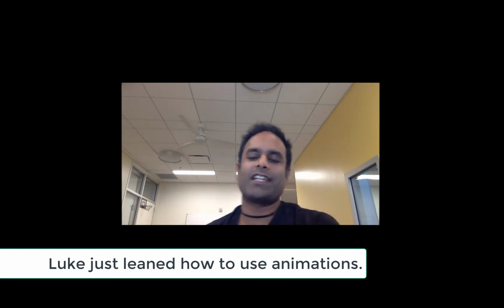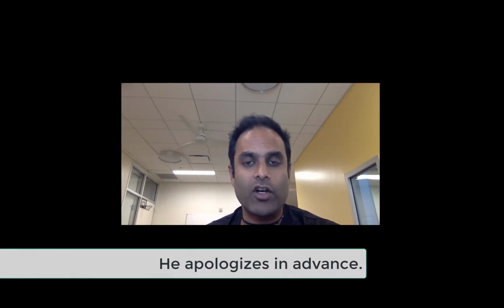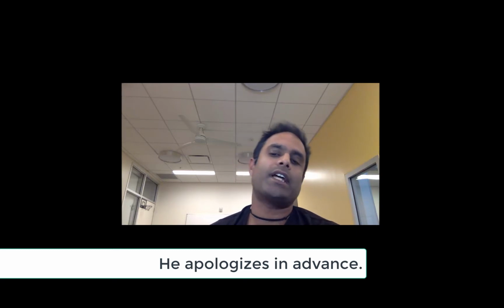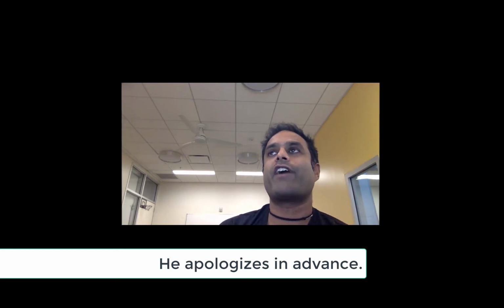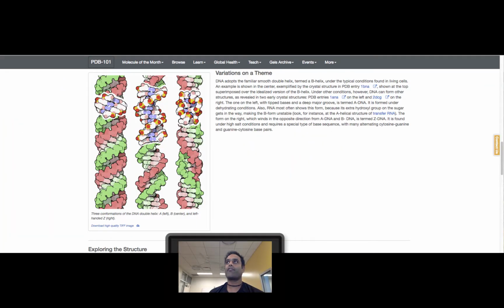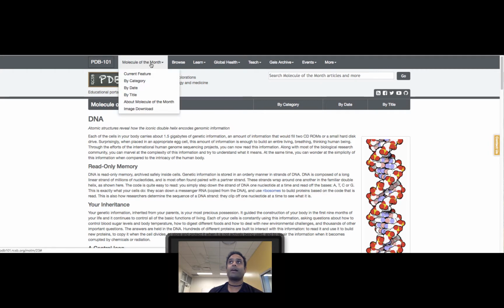Today we're going to be using some 3D visualization software called First Glance and JMOL, and I'm going to show you how to use that. But before I do, I want to show you the files that we're looking at and where I get them from. You can get PDB files from a lot of different places, but one of the best places is the PDB, the Protein Data Bank itself.